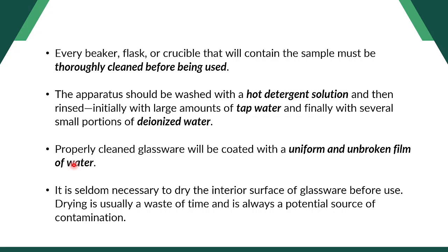Also, it is seldom necessary to dry the interior surface of the glassware before use. Drying is usually a waste of time and is always a potential source of contamination. Now, in chemistry class, usually we are not after mga microorganisms, no? Unlike in other subjects like microbio.